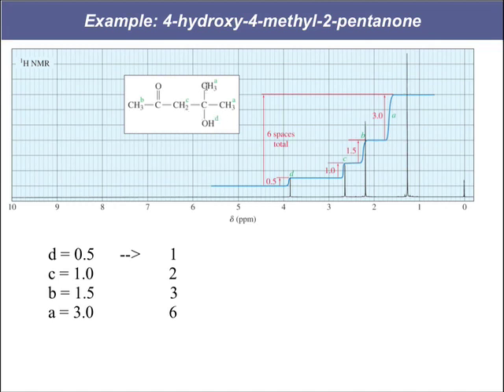So our A should be the lowest, and that's our biggest peak because there's 6 of them. Then we're going to have our B's, which are going to be about 2.1. That's what we see here. It's about 2.2. That's fine. Then our C's are going to come next, and see that they're at about 2.6 or 2.7. So that must be caused by the proximity to our oxygen. And then lastly, our D hydrogen is going to be at a little bit before 4.